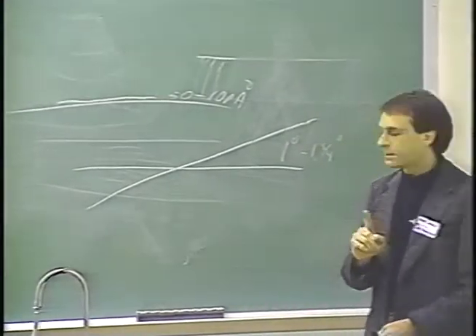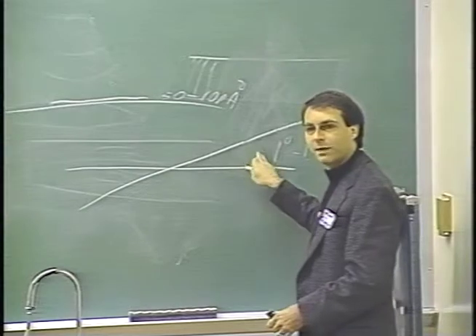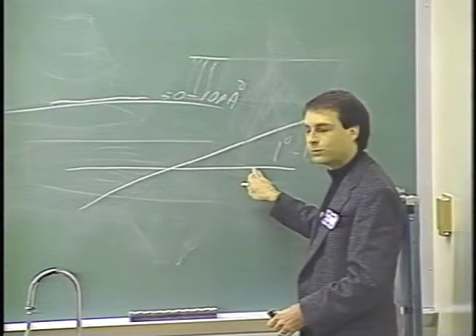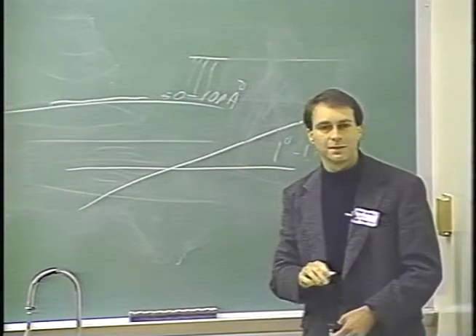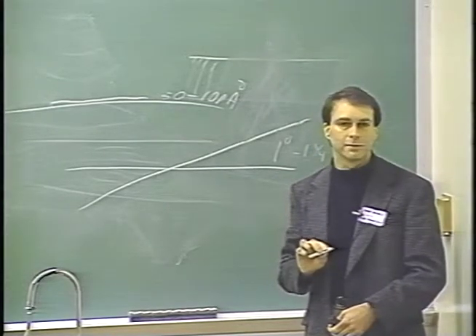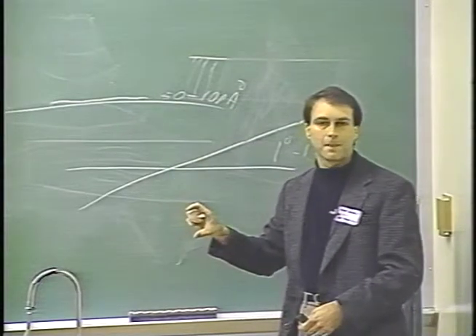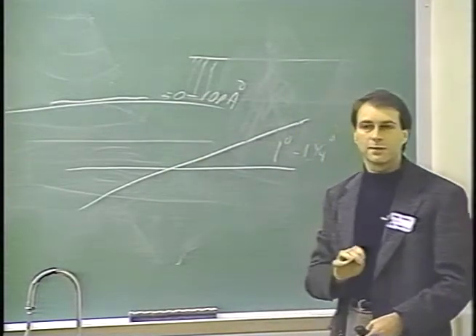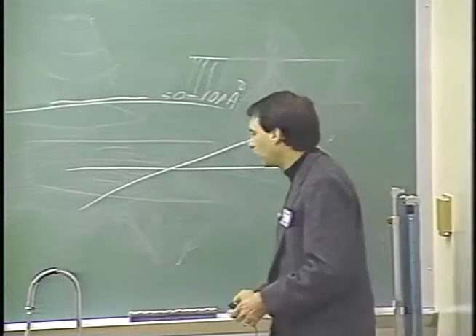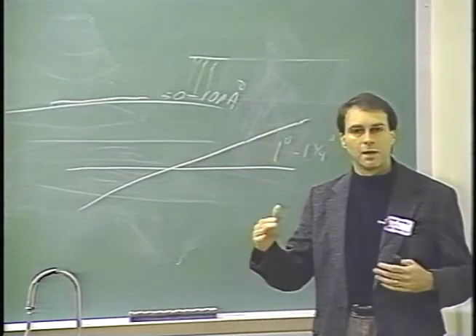What that means is, to extract that information and get this level of three-dimensional resolution, you have to be able to tell the difference between an image and an image which is only tilted by 1 degree or so. And remember, the specimen is a half micron thick. So the differences are quite subtle, and one needs a very large dynamic range so that you can detect those differences.